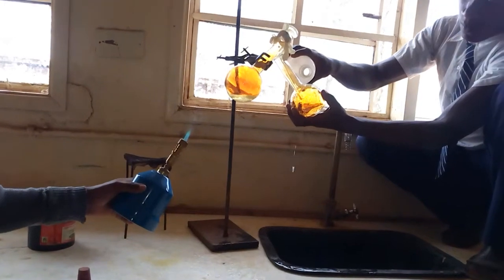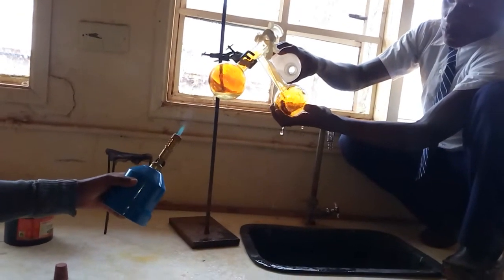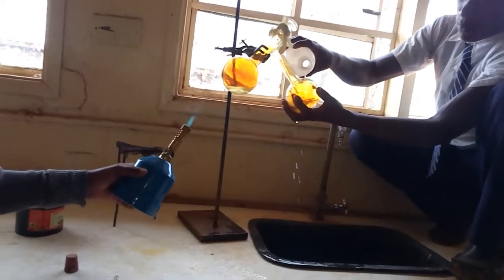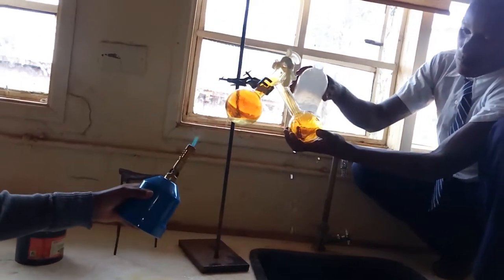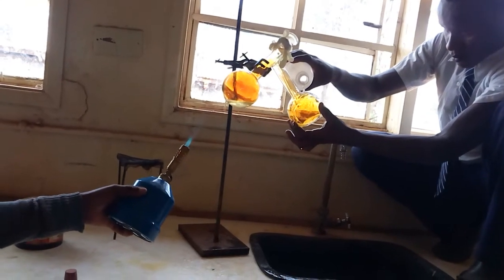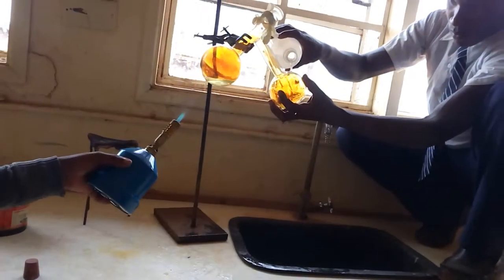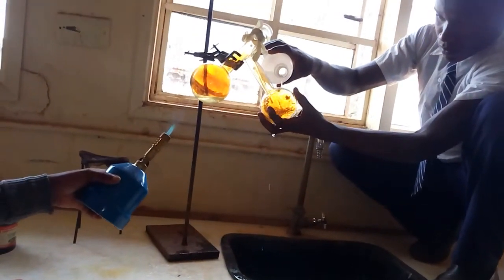On the right hand side you can see a student condensing the acid which has been produced. You can see it's quite yellow and it's being collected on the right hand side.